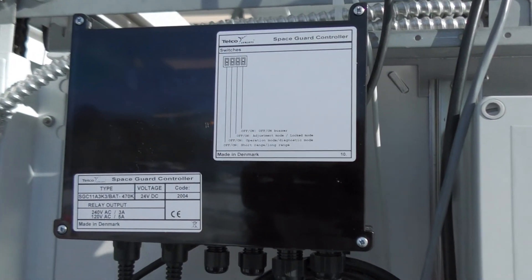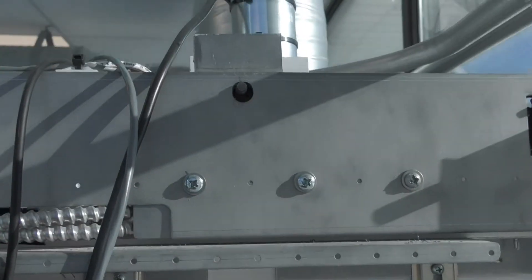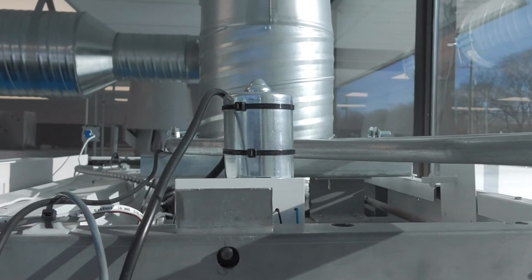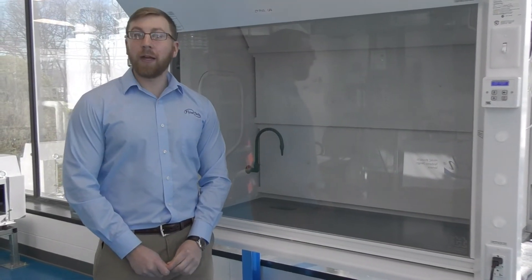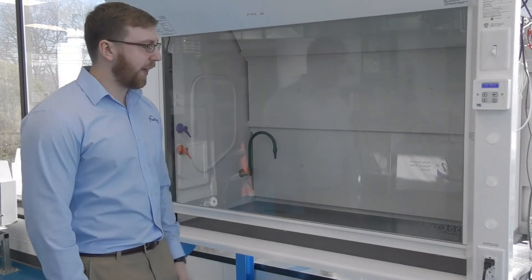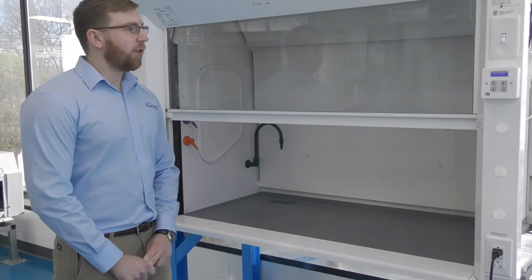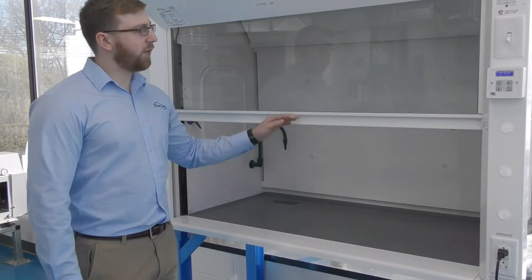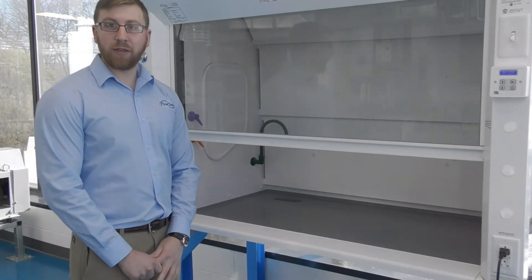The final components are the power supply, the control panel made by TEL, and the motor to cause the sash to move up and down. There are a few ways to have your sash move up and down using the TEL system. The first way is to nudge your sash and it will automatically rise to your set height position. To cause the sash to go down, you do the same in reverse — nudge the sash down and it will automatically close itself.